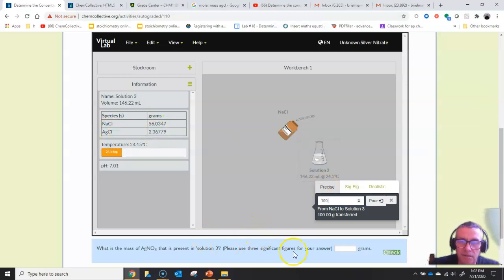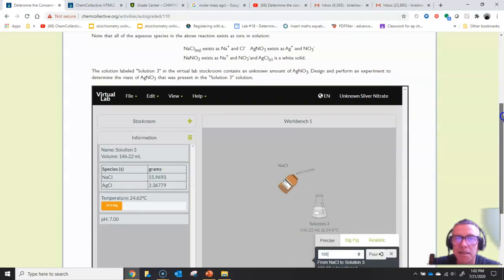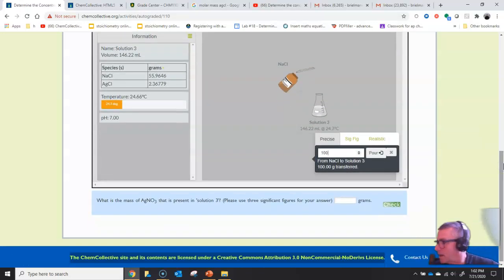So can we write that we had 2.37 grams of silver nitrate present? No, it turns out that silver nitrate, from which it was derived in a 1-to-1 ratio that you saw up at the top, see how one of these produces one of those, is a little bit heavier. The silver nitrate is 1.185 times heavier.